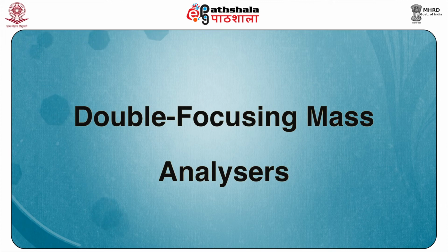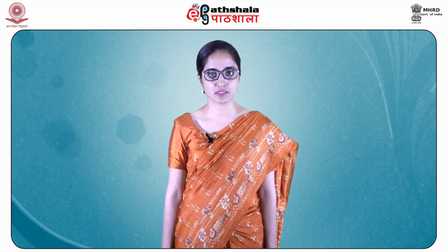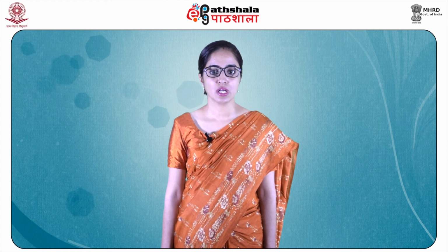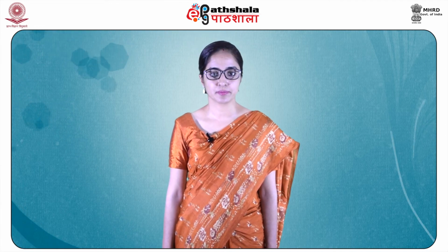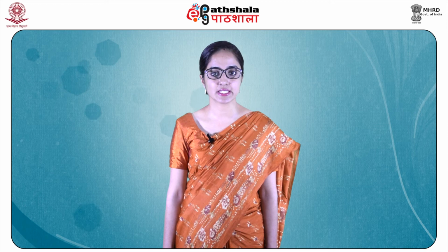Second in this is the double focusing mass analyzer. Magnetic field analyzers are used today only in double focusing mass spectrometers. The particles leaving the ionization chamber do not have precisely the same velocity. So, the beam of ions passes through an electric field region before or after the magnetic field sector. The particles describe a curved path in each of these regions and the resolution of the mass analyzer improves by a factor of 10 or more over the magnetic field sector analyzers.